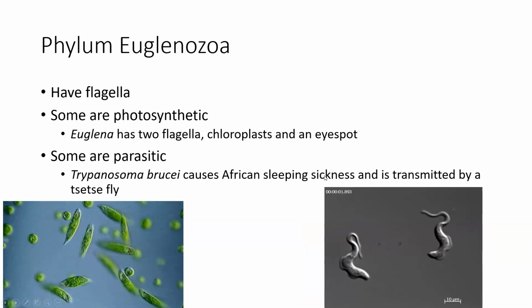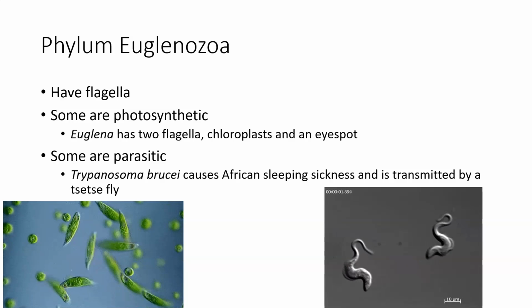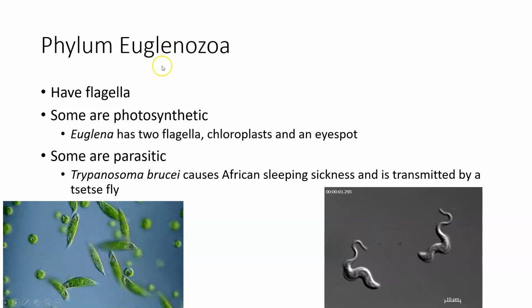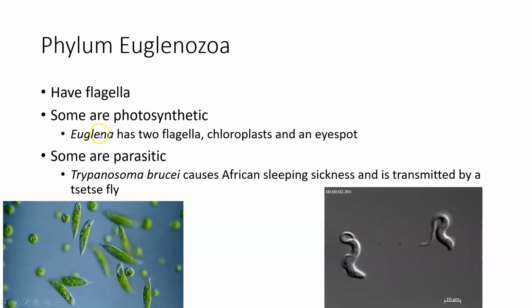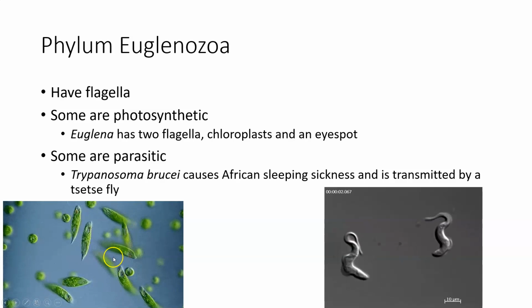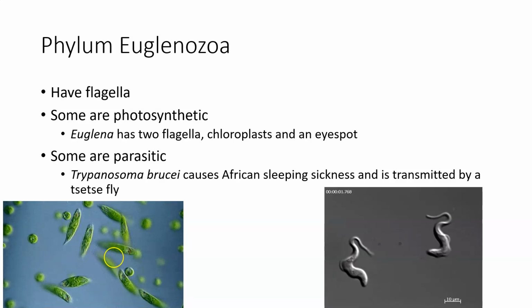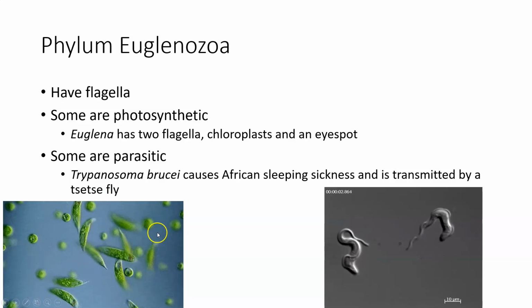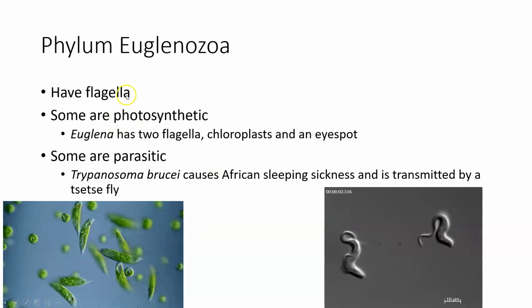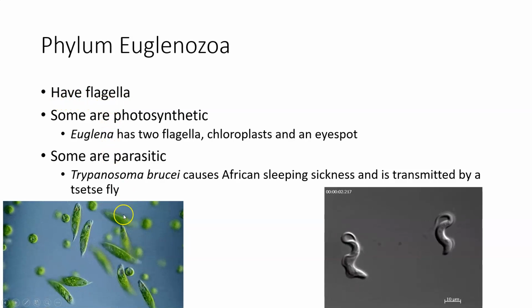All right. So flipping back. Euglena. We've already said it's a protozoan, so kingdom Protozoa. It's in the phylum Euglenozoa. This is one of the times where, yay, the name actually kind of goes together. The Euglena organisms can be photosynthetic if the water is nice and clear. If the water quality starts to get poor, though, they will actually kick their chloroplasts out and then become eaters at that point. So your characteristics for this particular phylum is this top one.